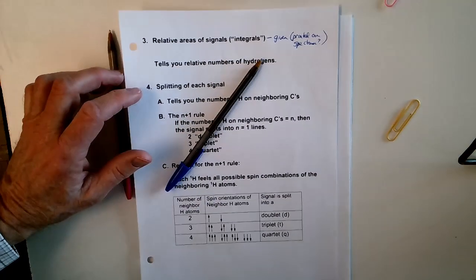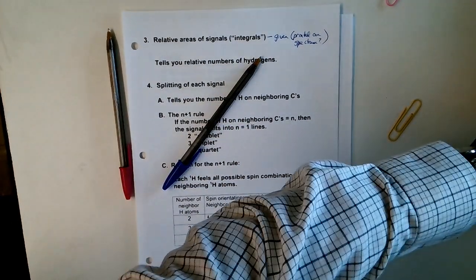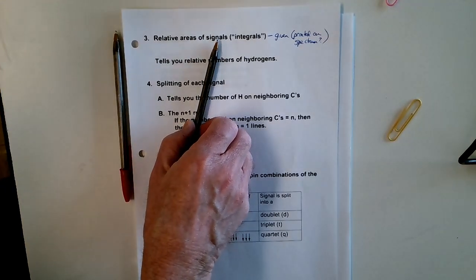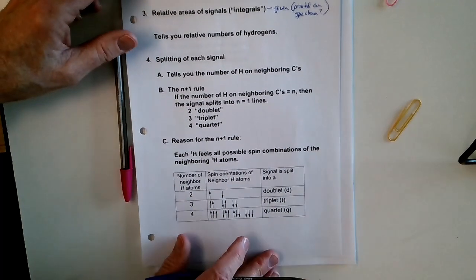But you can't just look at a spectrum by itself and be able to tell what the area of a signal is. The instrument has a mathematical function that does it, and it's very quick at spitting it out for you. Okay, talk about how to use that.